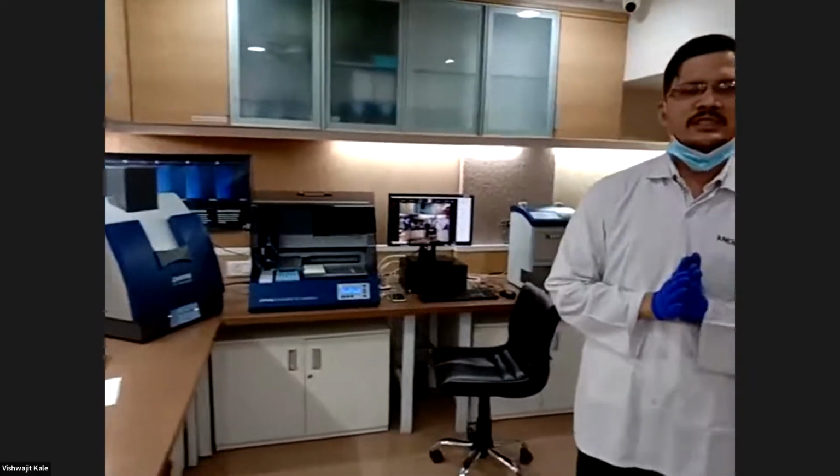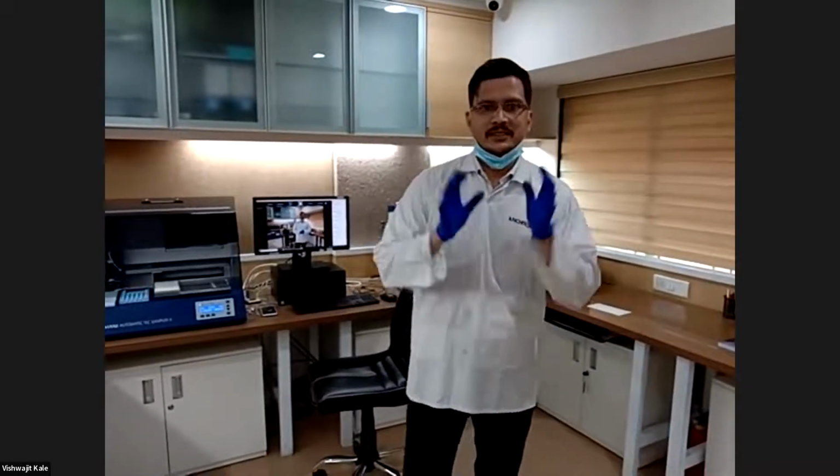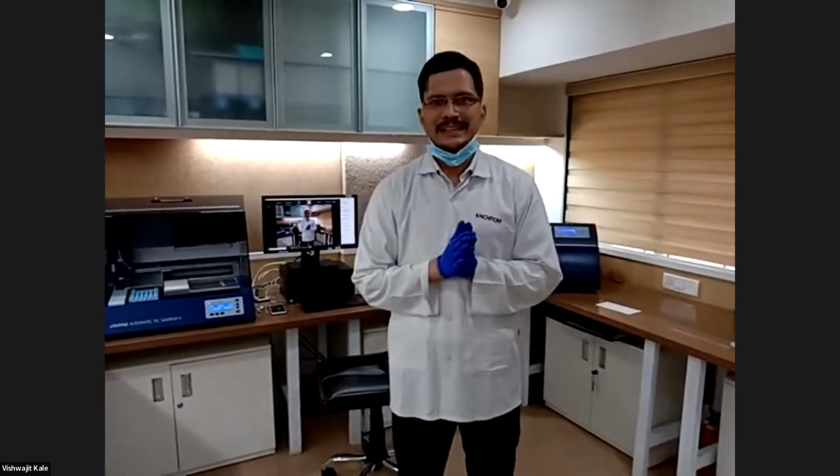So in this demonstration, I will show you the DPPH assay. That is useful to detect antioxidant compounds from our sample matrix. We have already developed one plate this morning, and along with that, I will show live application and plate development, and we will discuss and conclude the results after completion of one complete analysis.